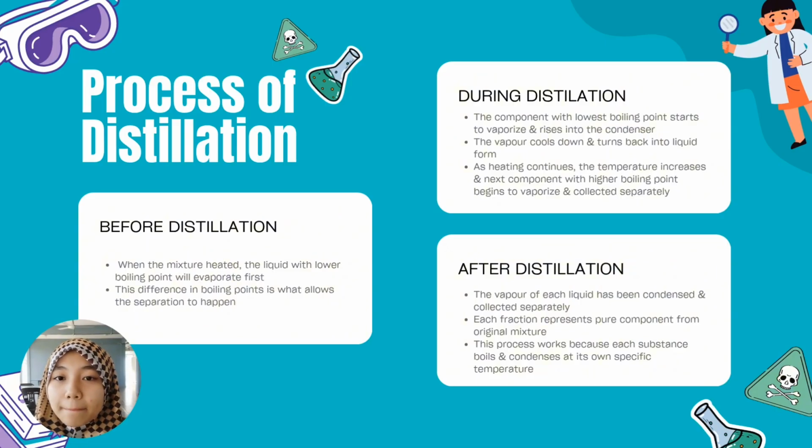After the distillation, both liquids were successfully separated and collected separately. A total of 8 ml of diethyl ether and 8.3 ml of toluene were obtained. Both were clear, colorless, and immiscible with water, confirming that the process was effective.